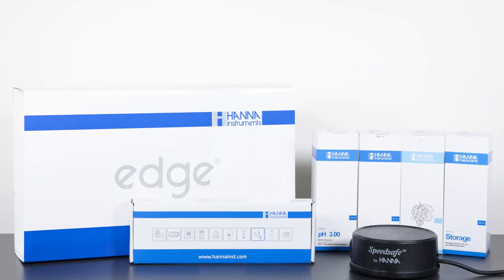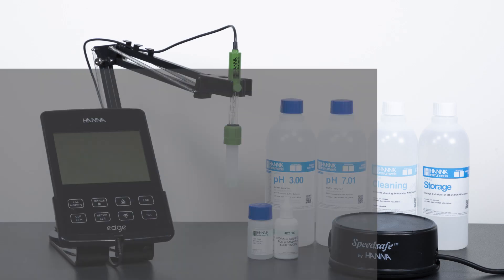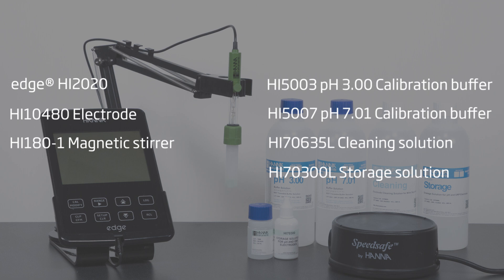Hanna Instruments has put together a wine kit using our Edge HI-2020 pH meter. When you receive your kit, you'll get a wine-specific electrode, a magnetic stirrer, and all the solutions needed to perform your calibrations and maintenance.